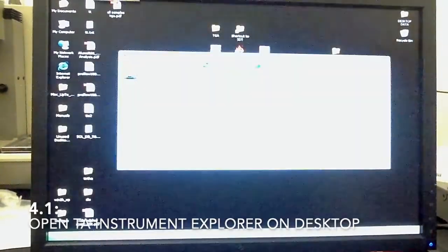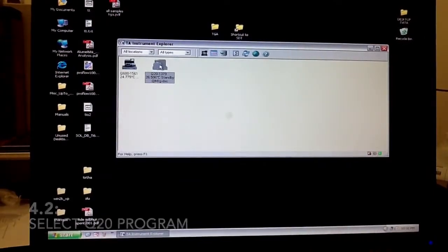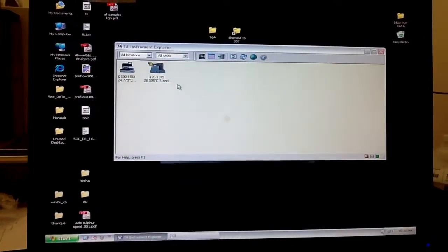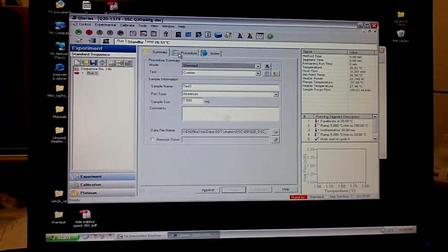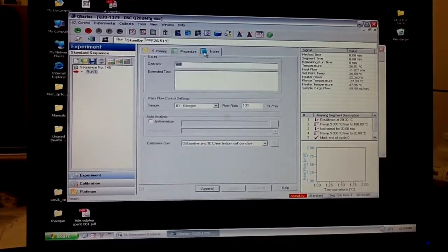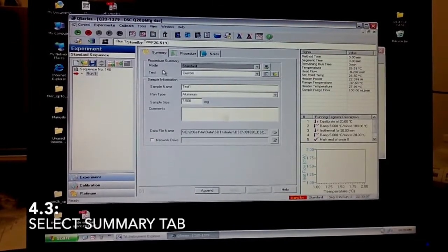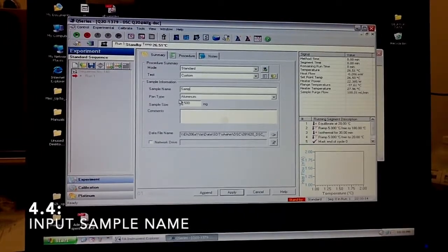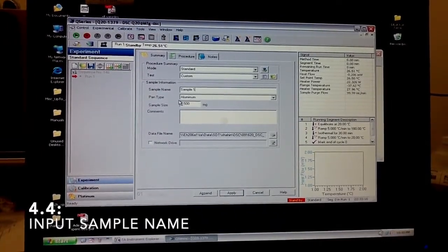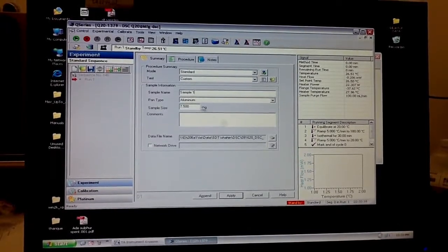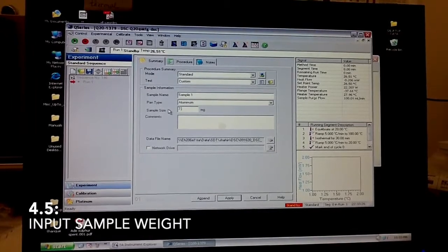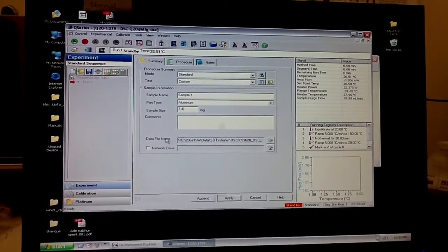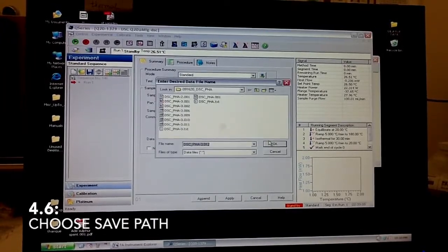The software that I use is this TA Instrument Explorer. And for the DSC, you can use this Q20. Once you're here, you only need to explain yourself with these three tabs here. On the Summary tab, you can use it to put in a sample name. The pan type is AL, and if you have recorded your weight back at the scale, then you input it right here. You also can use this right here to choose your save path.